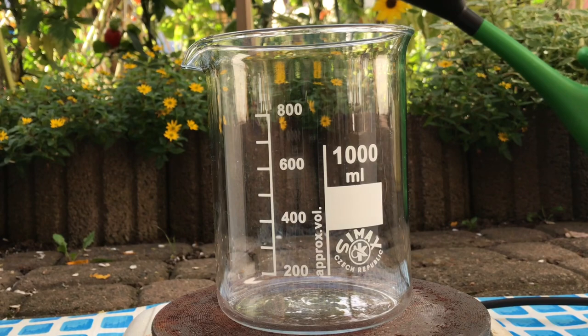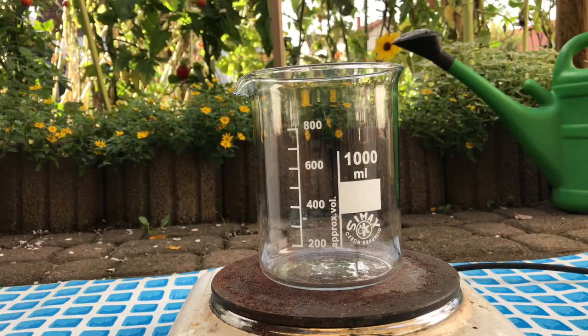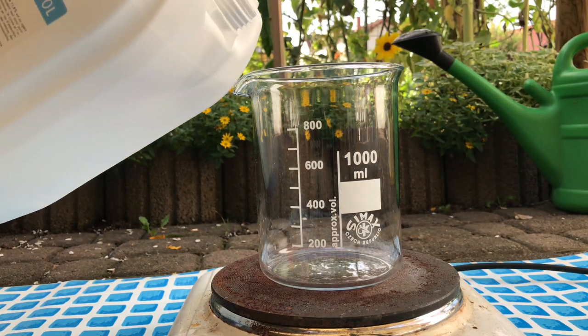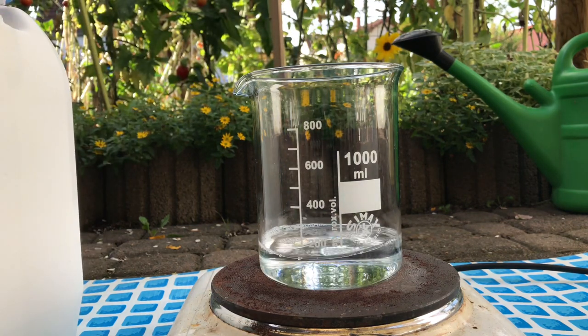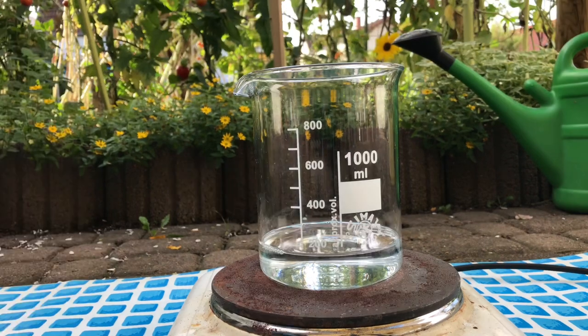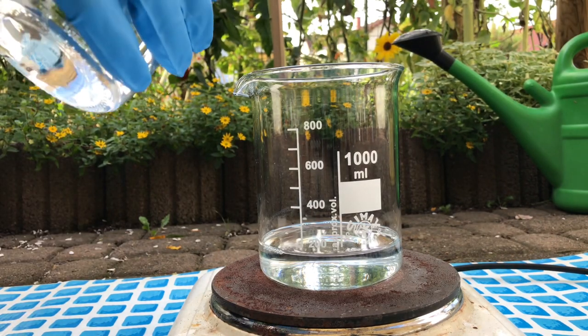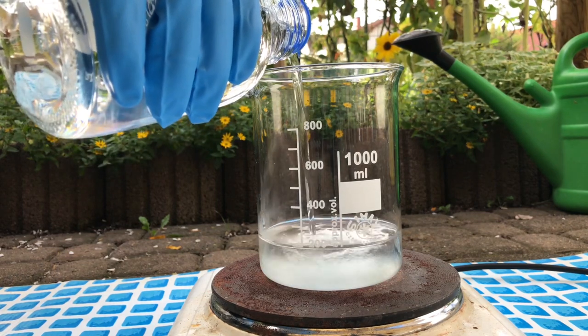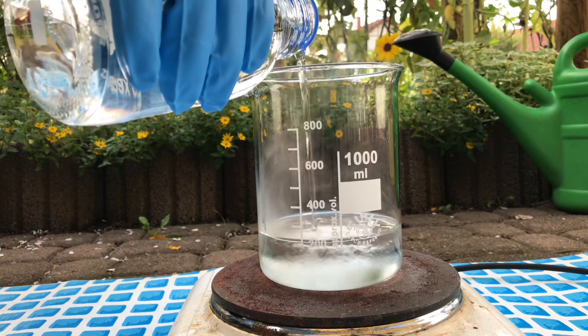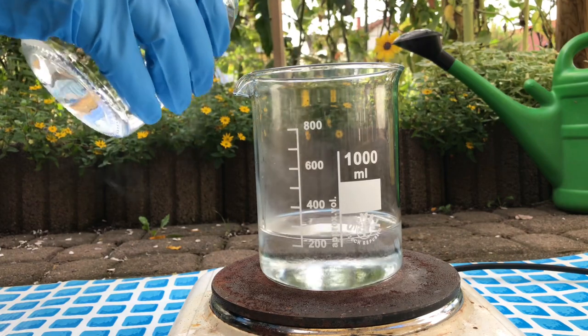We start off by adding a large portion of hydrogen peroxide to our beaker. This was followed by a nearly two times larger amount of concentrated sulfuric acid. The addition has to be done slowly because it will heat up quite a lot.